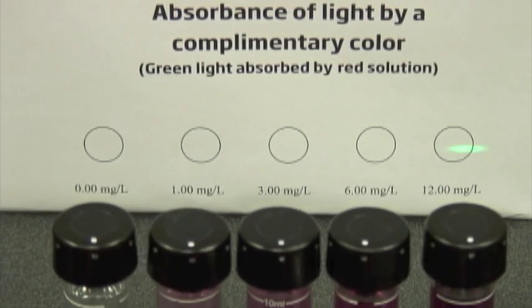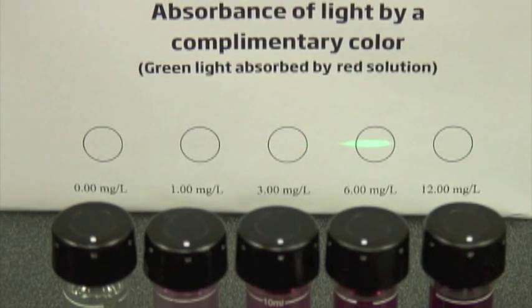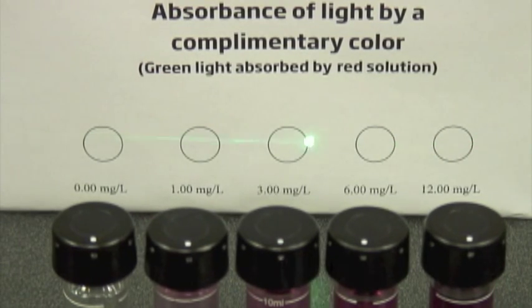And this is actually a pretty powerful laser. When we go back into air, we can see it clearly. Going back — dim. So this is the principle upon which Beer-Lambert operates, where it's actually absorbing the color.